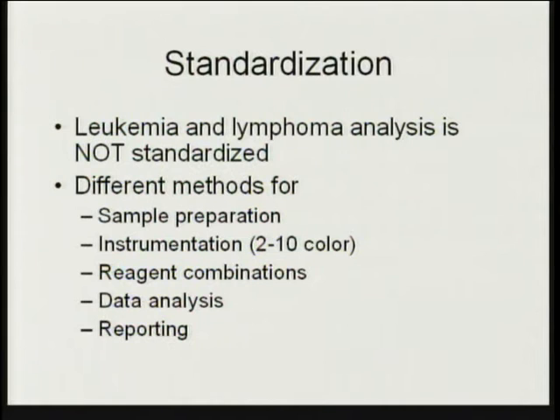If you look at an assay that's not standardized, this is the prototype for it. There's no standardization here. And this results in a huge variability in quality in terms of what's done in a clinical laboratory. Some labs do a very good job. Some labs do, I think, an actually very poor job of this type of technique.